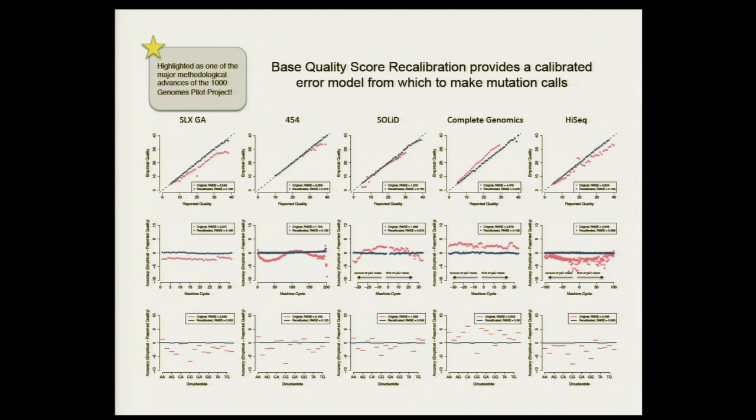Could this step also be applied for IC data? Yeah. I mean, as long as you have enough observations, yes. And you would want to discount the sites of known variation. But yeah, as long as you have enough observations, it would still work, yeah.